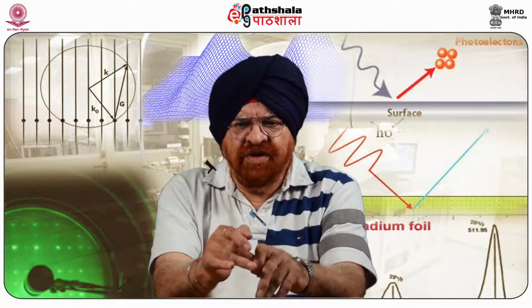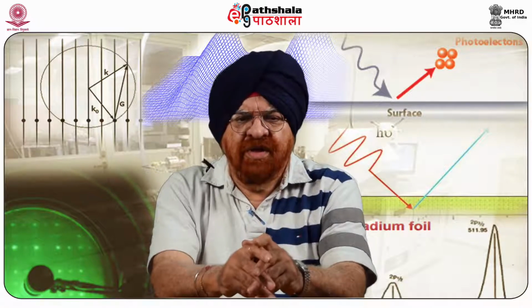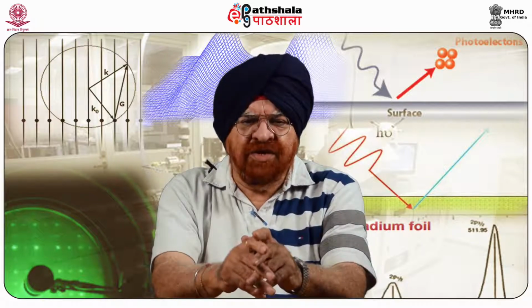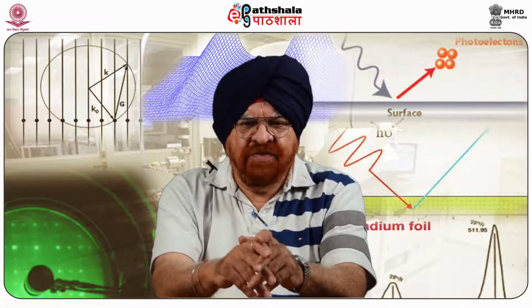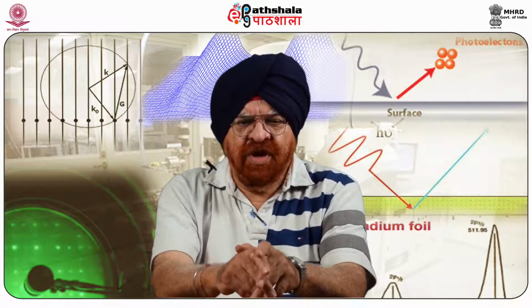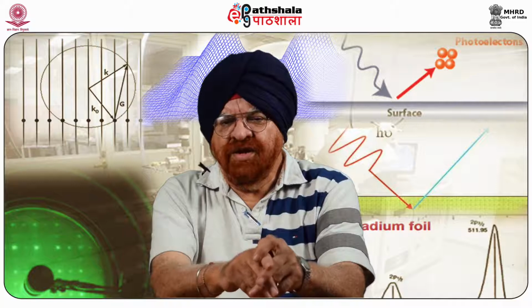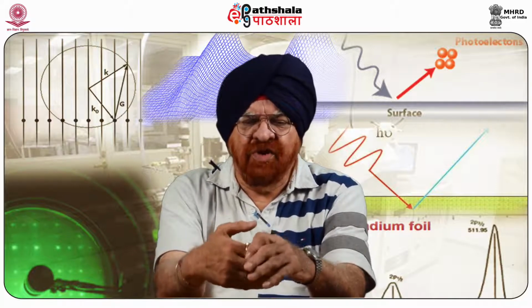The cantilever is not piezoelectrically driven at its mechanical resonance frequency, ω0 as we call it, as in normal AFM, although an alternating current voltage is applied at this frequency here also, as we do in the case of AFM.